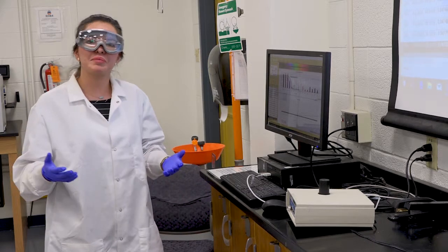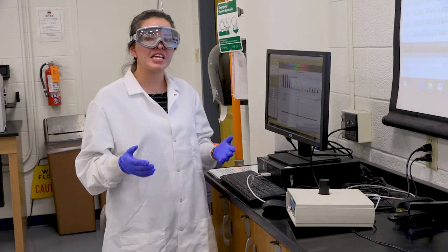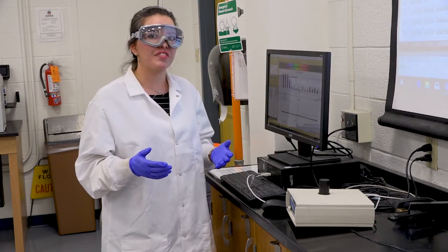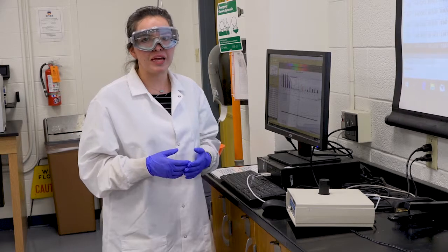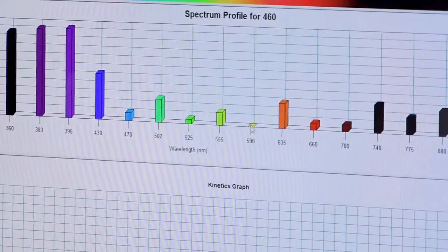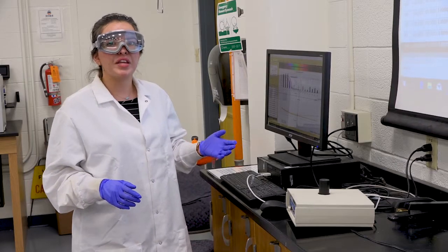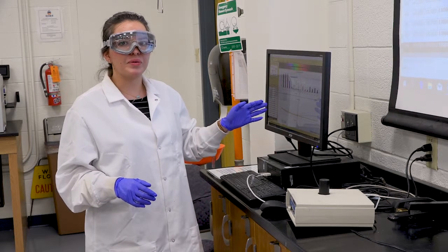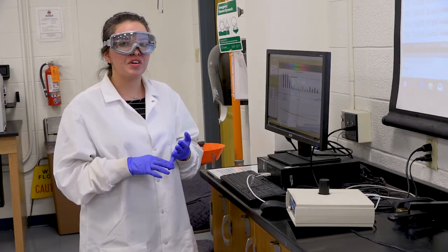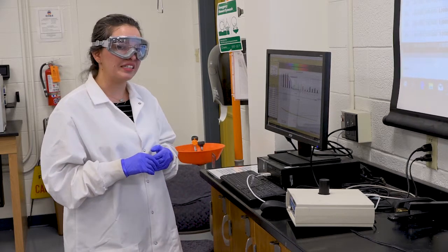Now we're gonna tie things back to the theory that was discussed previously, and we're gonna click on the bar graph, specifically at 590 nanometers on the graph that corresponds to the lambda max for crystal violet. Once we have that graph pulled up, there's different tabs on the computer that we can look for the order of the reaction. Now the reaction's either going to be 0, first, or second order with respect to the crystal violet.